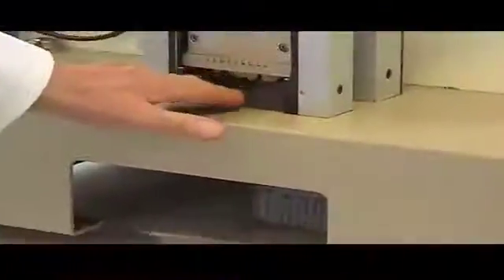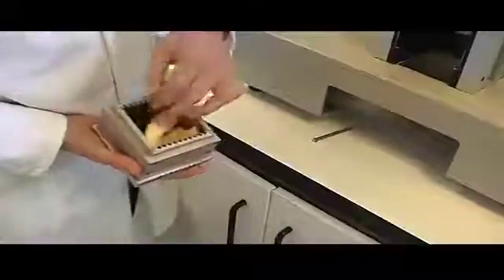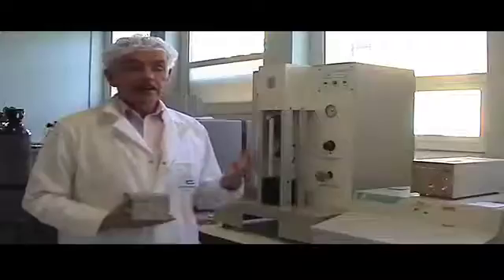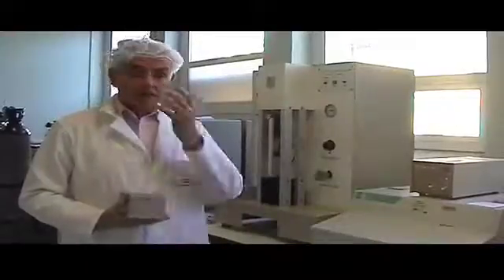We would also put them through another machine called the shear press, which measures the texture of these products. It gives us the chewiness. One of the major tests we conduct on our products is texture. For products like wedges we use two different types of instruments. A machine such as this, called the shear press, measures the texture of a bulk sample — say 100 grams of apple wedges at one time — and it mimics the chewing action of the human teeth.